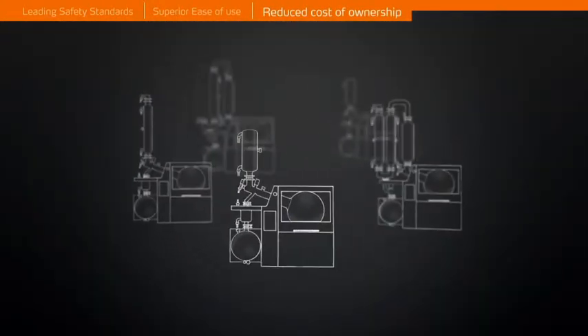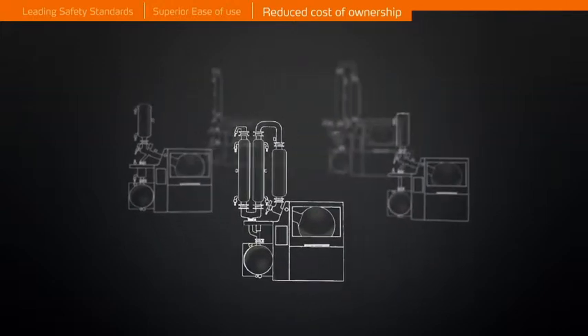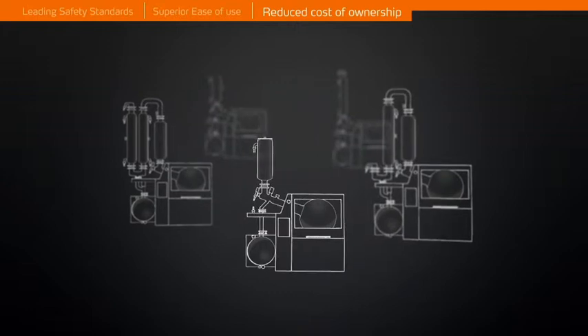Choose from 10 application-specific glassware sets. All glassware assemblies are accommodated by a safety housing.